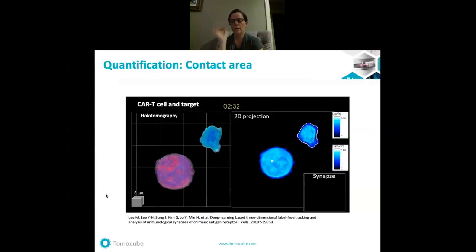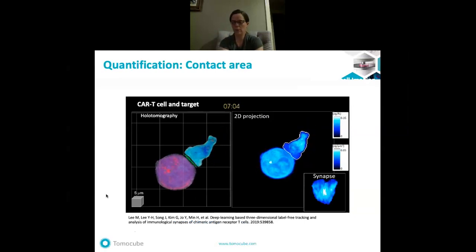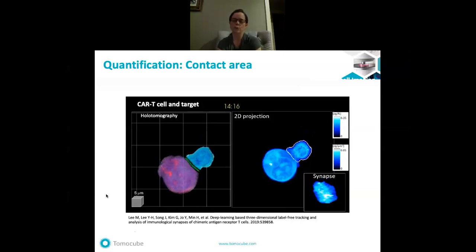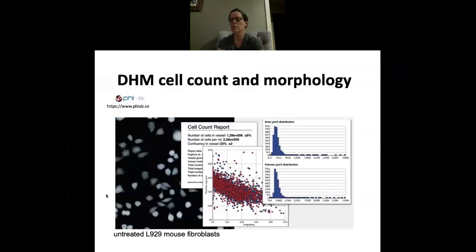Both TomoCube and Nanolive are developing tools to improve the experience of interpreting quantitative phase results. They each have a variety of tools for making color mapping of refractive index ranges to highlight the specific intensity distributions appropriately. Both companies have a library of clearly defined and validated protocols for specific applications.